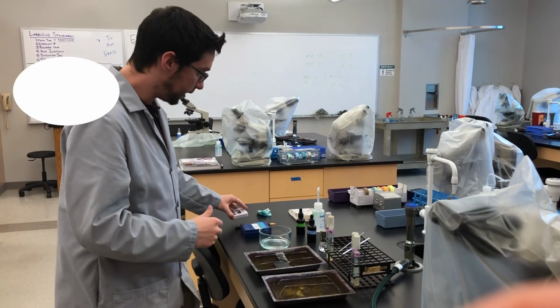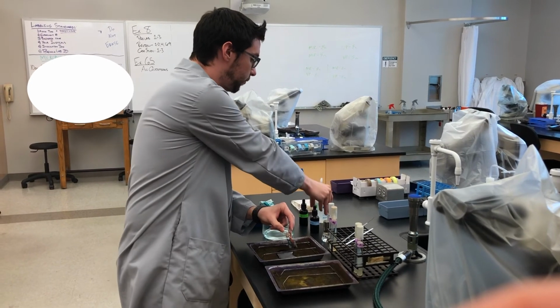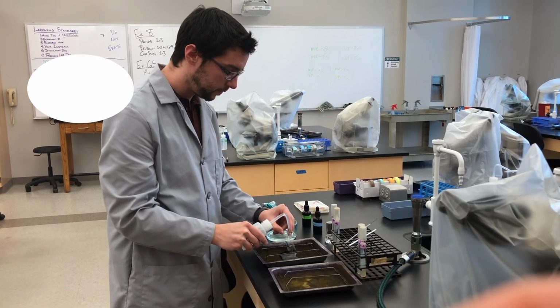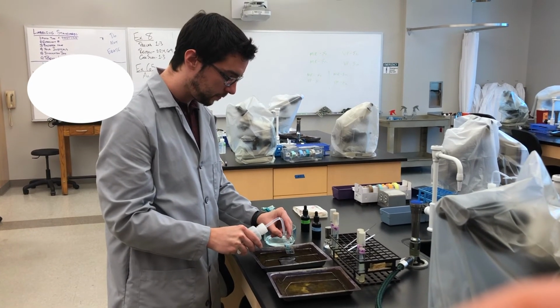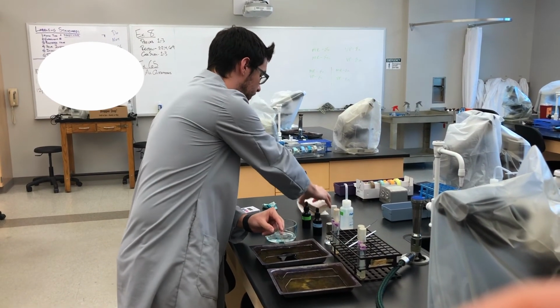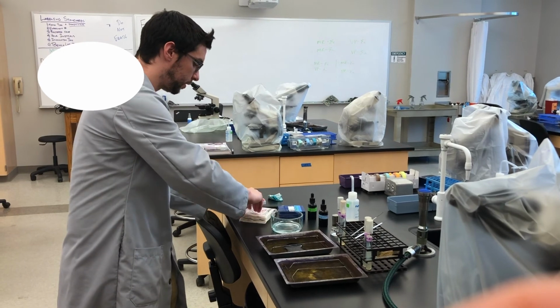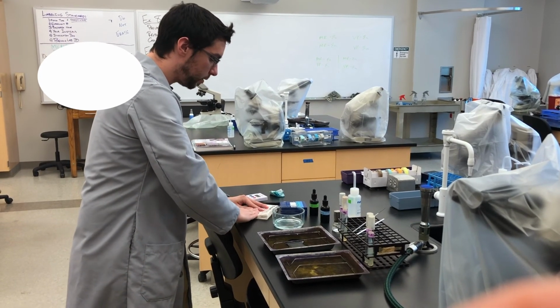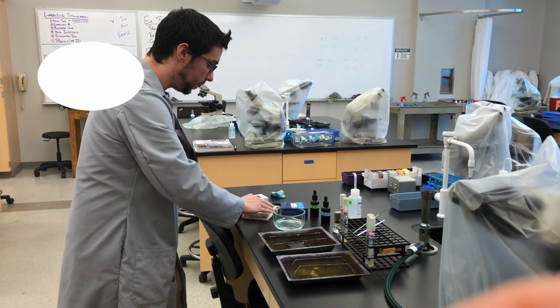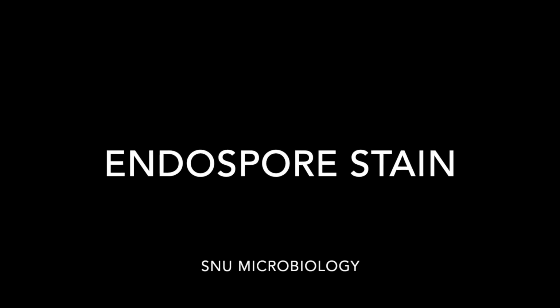All right, so our minute has passed. We will simply wash this off. And dab dry with bibulous paper. Again, be careful not to rub the culture, the smear, off of the slide. I still see a lot of people rubbing the paper. That's a no-no. You risk wiping the bacteria off. And now we have an endospore stained slide.